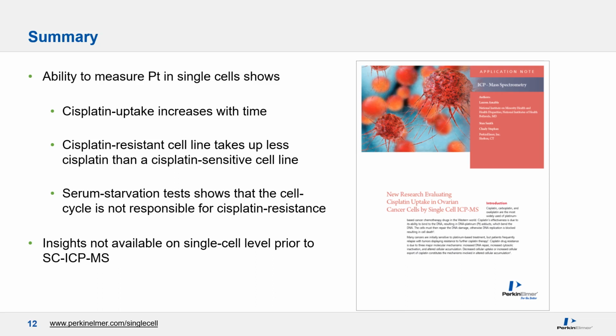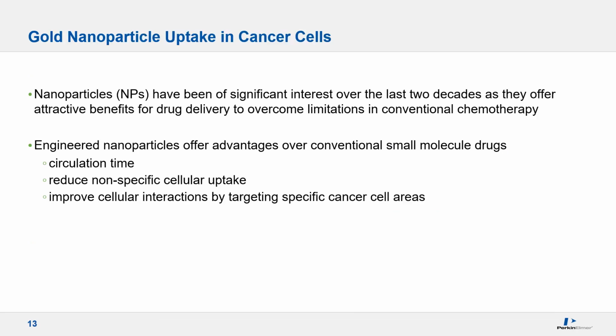So in this respect, a number of control experiments were included, and all of this is published in our app note, which was done by my colleague Chadi Stefan in collaboration with the researchers from the National Institute of Health. And in summary, we are now able to get insight from those types of experiments at the single cell level, which was not possible before. Let's move on to gold nanoparticle uptake in cancer cells.